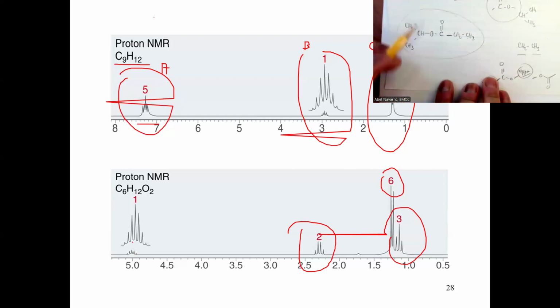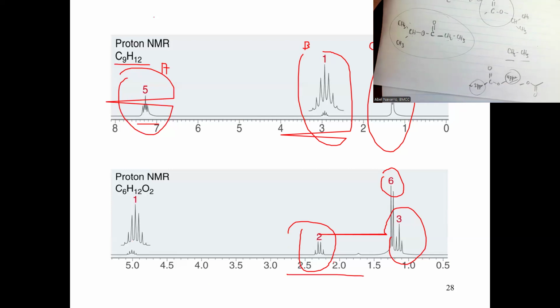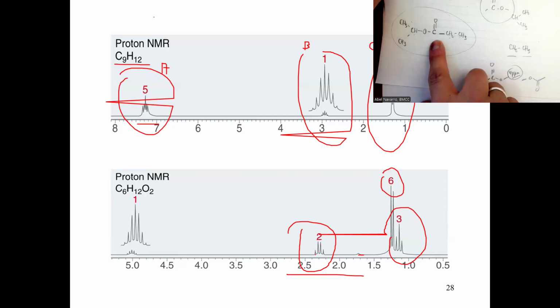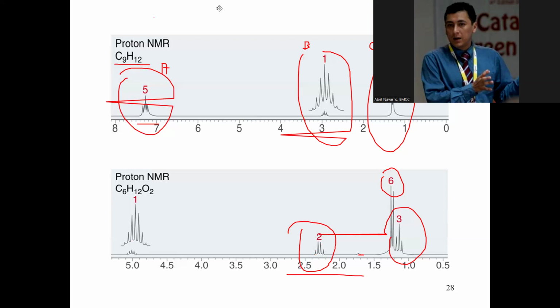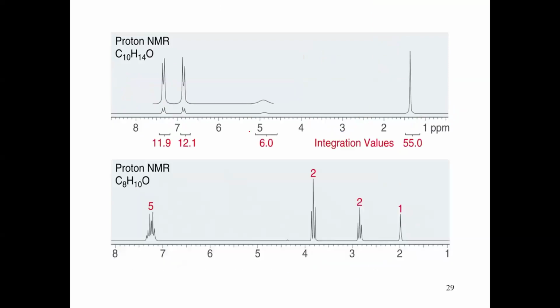Once again, how do I know that? Because the CH next to COO is about 2 ppm, and that's what I see here. The ethyl is closer to a 2 ppm range. So this one is noise. This one should be the COO side, right? This side of the ester. Good. Okay, great. Right, so let's go to the next one.